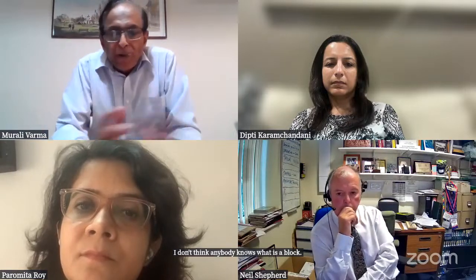Well, related to that, Jamie Wilson has asked, can't the RC path assist in defining what a block is? I mean, a block is a block, as far as I'm concerned, irrespective of the amount of tissue in it. Paramita? Yeah, correct. So that's basically, we are trying to get that debate going. Right. So this is a start with that.